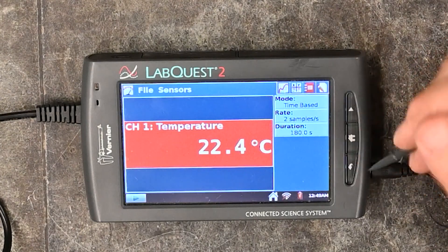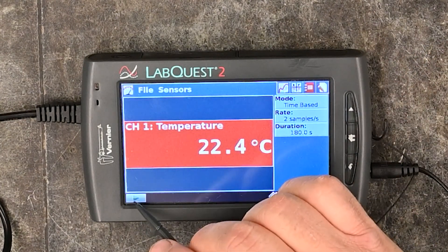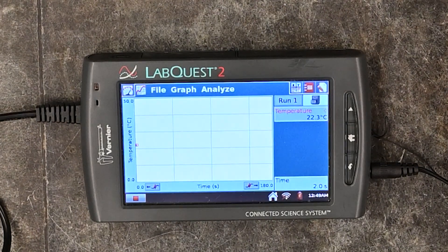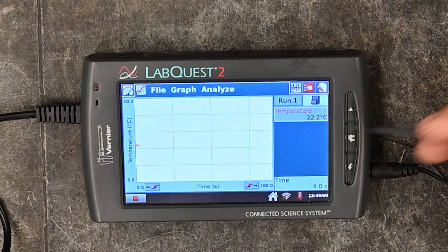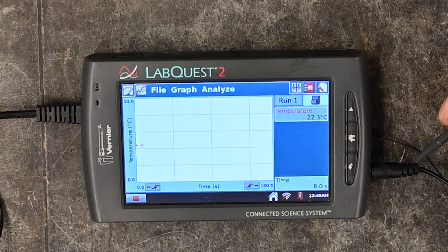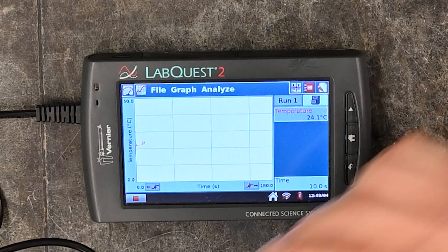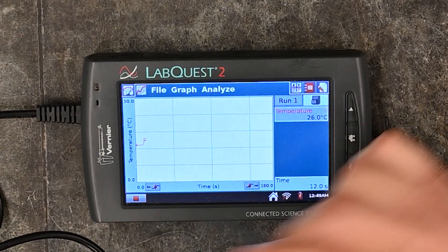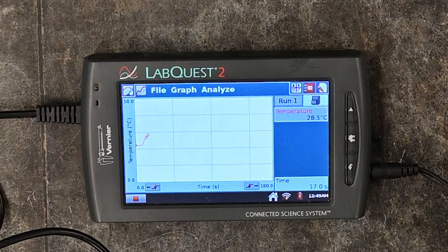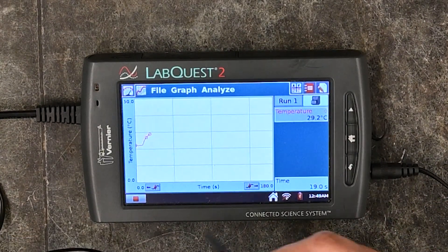Once you have everything set up, you can hit the little play button and it will start collecting your data. Once you've collected the data or it completely times out, it will stop. If you need to stop it before then, there is a red stop button you can hit. I'm going to collect just a little bit of data here and then we'll stop and look at what it does.